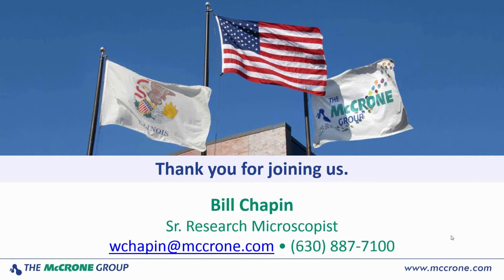So lots of sample prep tips, including tungsten needle making and sharpening. We also have a YouTube channel, and videos on our website. Go to YouTube, type in Hooke College YouTube, and there's a video, about 3 or 4 minutes, on how to make a tungsten needle.